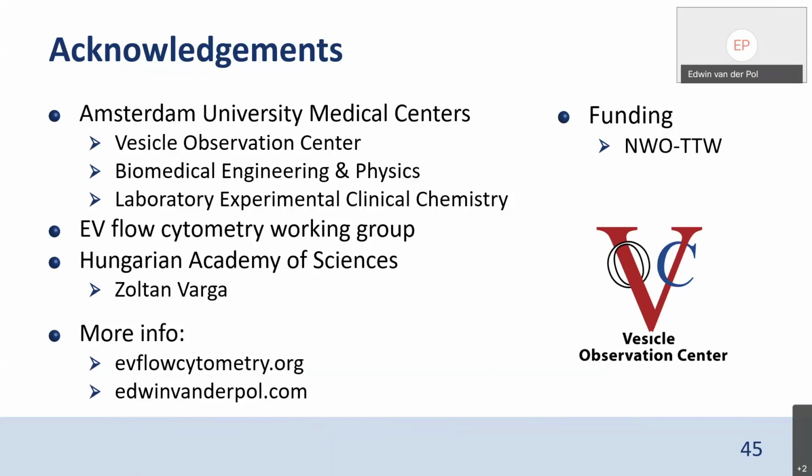Whereas with scatter, besides the scatter from your EV, you will always have some background scattering from the laser and the optics in the flow cytometer. So from that perspective, you would say you get a higher signal-to-noise ratio for fluorescence detection. In practice, I think many flow cytometers have this. Ours not. The flow cytometer which we use is about as sensitive for triggering on scatter as triggering on labeled EVs. So it's just a matter of figuring this out for your flow cytometer.